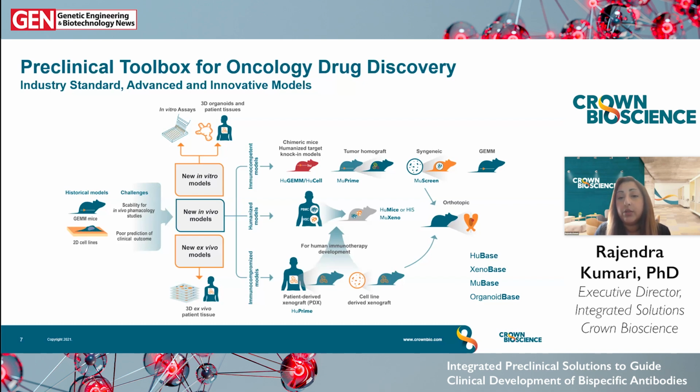And also in vitro, the advances in culturing, assay conditions, and data acquisition for that sort of complex in vitro 3D biology that's emerging has really provided more valuable insights early in the drug discovery pipeline, as well as potentially screening patient tissue directly, either ex vivo or in 3D organoids in vitro. And this again, combined with technology such as high content imaging and AI-led analysis, is really making a big difference.